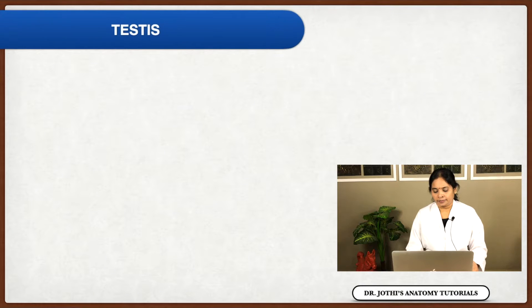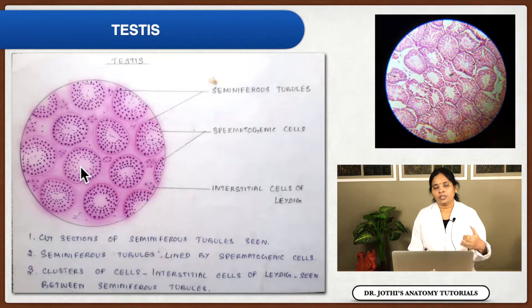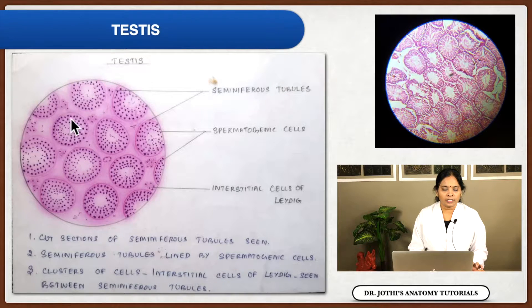Welcome students. We are going to see the histology of the male reproductive system. In a slide, we will typically see the testis, epididymis, vas deferens, and accessory sex glands — seminal vesicle and prostate. Starting with the testis, it is the male sex gonad. As a gonad, it is surrounded by a capsule.